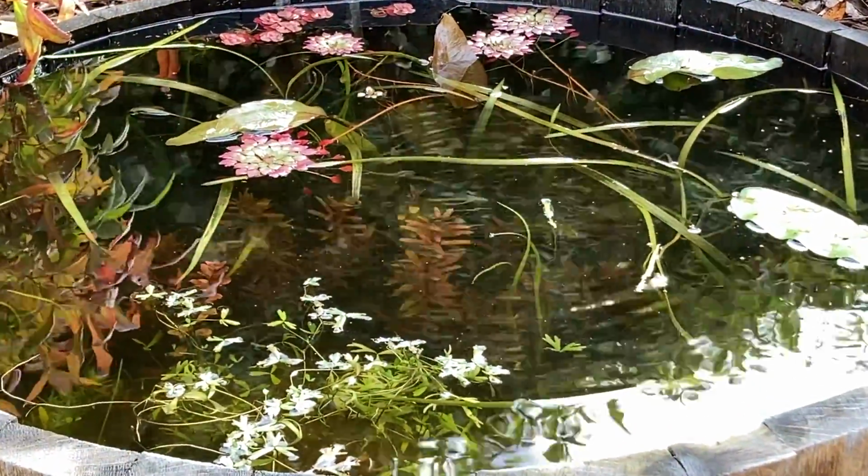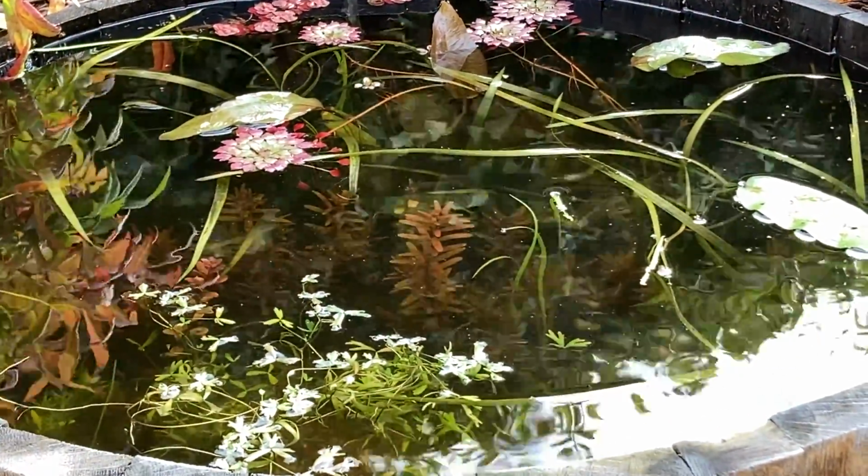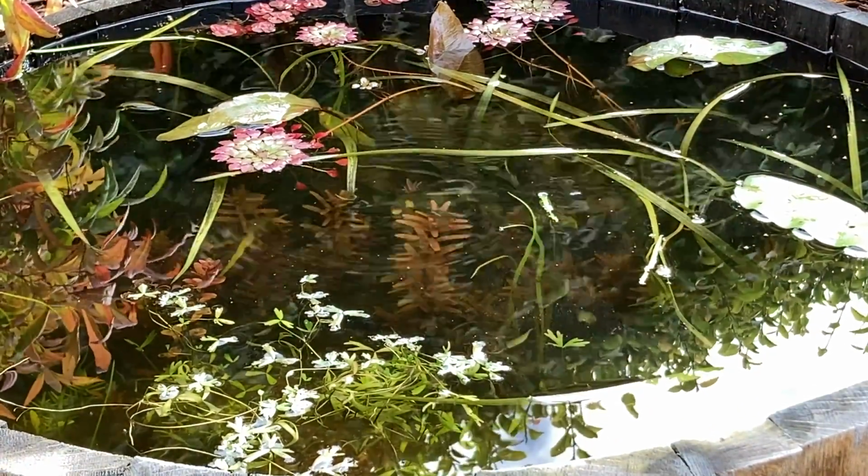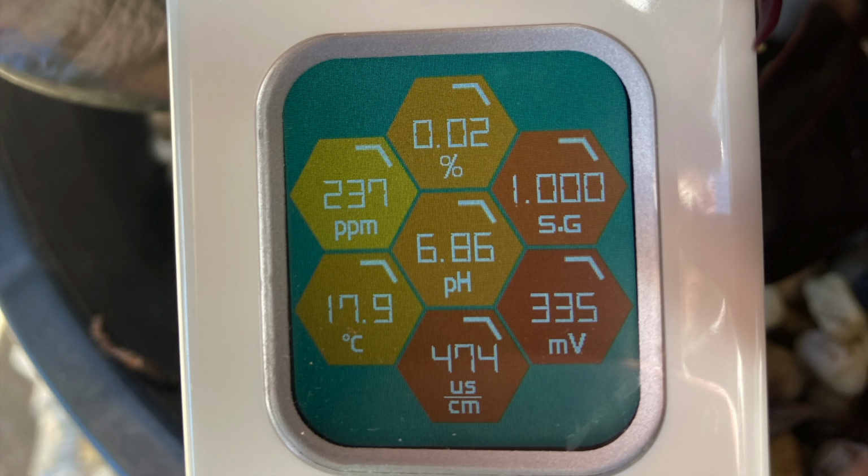It's got no pump, no dedicated filter, although the deep substrate and the plants should be providing enough filtration. Here's the reading on that. The pH is lower than 7, probably to be expected with the wooden barrel and dirted bottom. Nothing else looks too out of the ordinary there to my untrained eye.